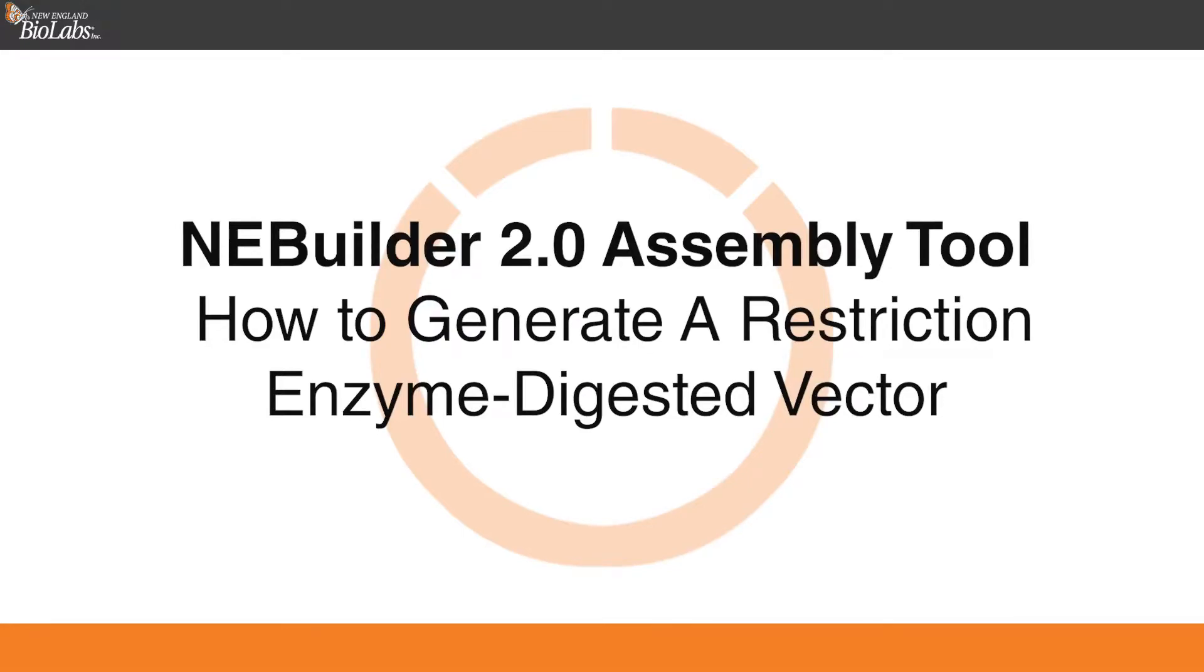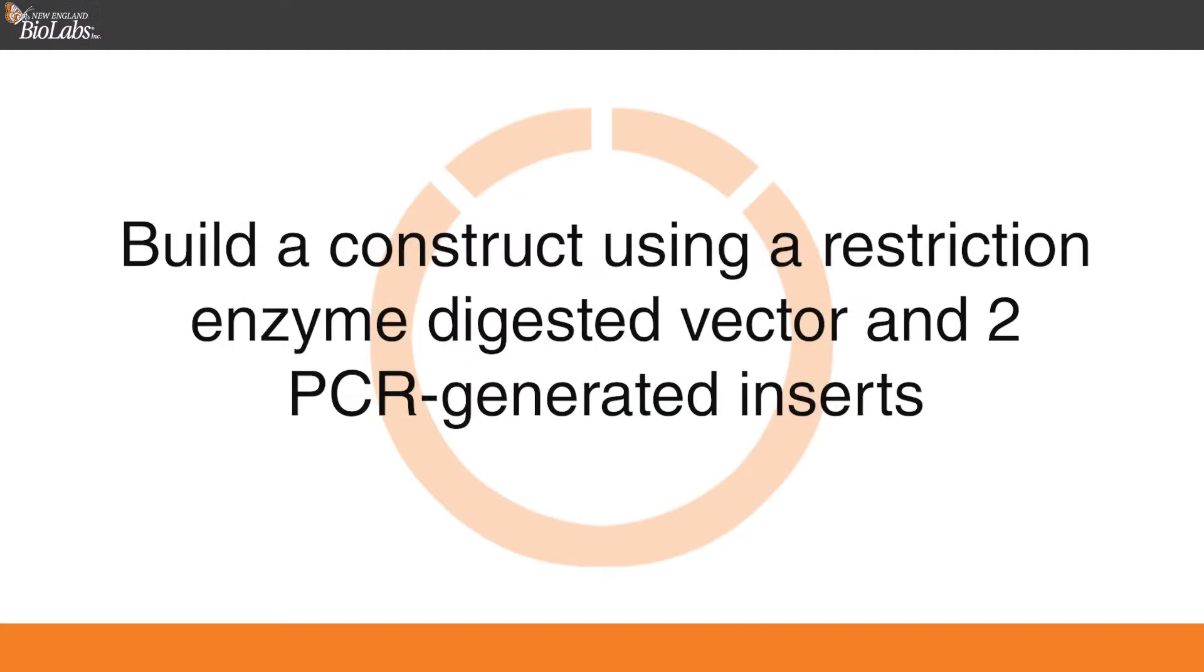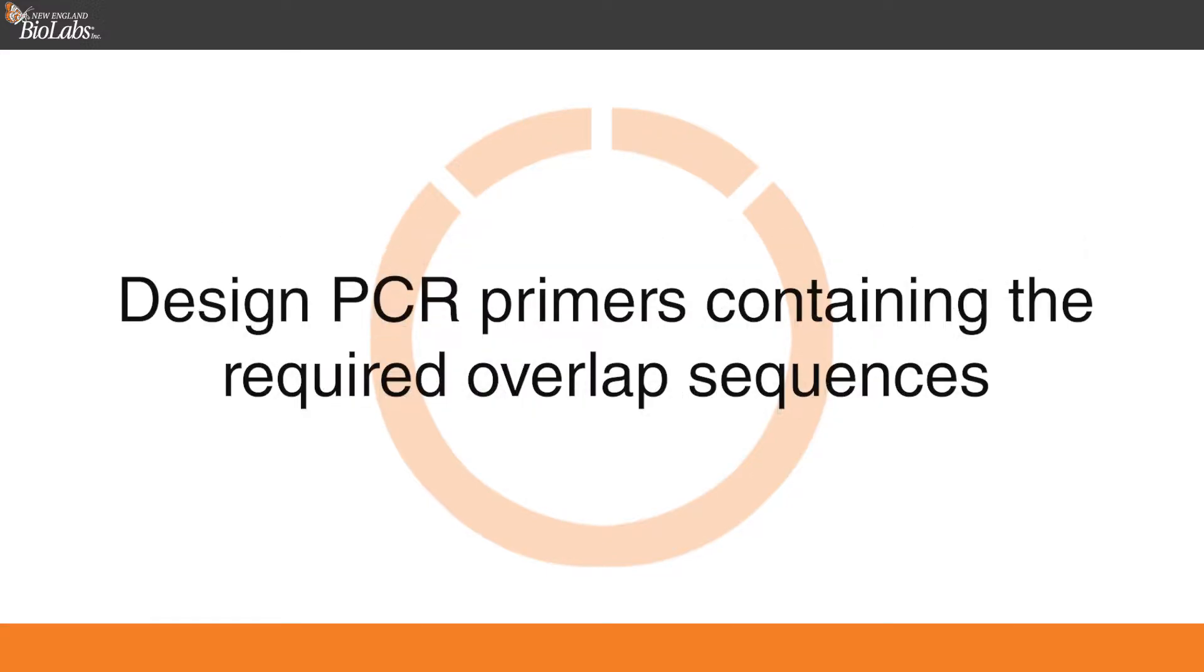NEBuilder 2.0, generating the vector by restriction enzyme digestion. In this video, we will demonstrate how to use the NEBuilder assembly tool to build a construct using a restriction enzyme digested vector and two PCR generated inserts. The tool will help to design PCR primers containing the required overlap sequences.